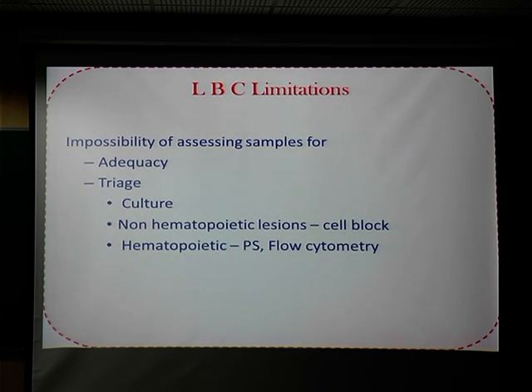Now what is the limitation of LBC? It's impossible to assess the adequacy of the material. You are taking a sample, suppose you take FNA or you take a sputum sample or you take a fluid sample, immediately you have to put it in the vial. So there is no scope of doing on-site evaluation of the material, which, you must have heard about ROSE, that is the rapid on-site evaluation of the material.